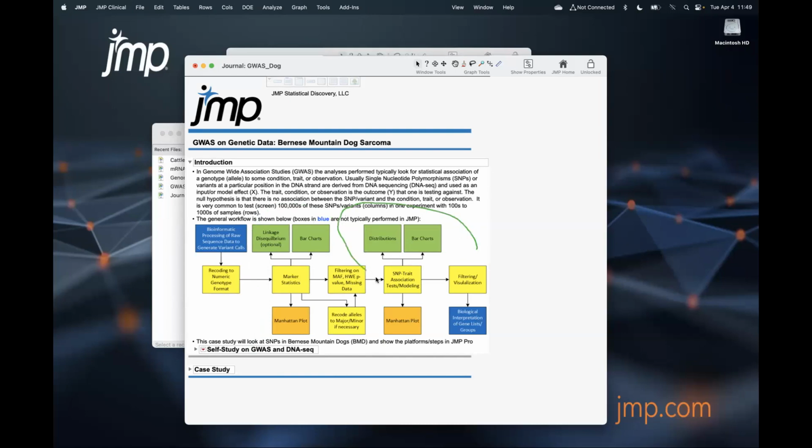And then we want to do our modeling, a SNP trait association test. And again, you get some Manhattan plot. We might want to look at some distributions. If you want to look at volcano plots, you possibly could, right? And then you filter and then save out. So that workflow looks complicated, but it's more of a mental workflow, and it's not as many steps.